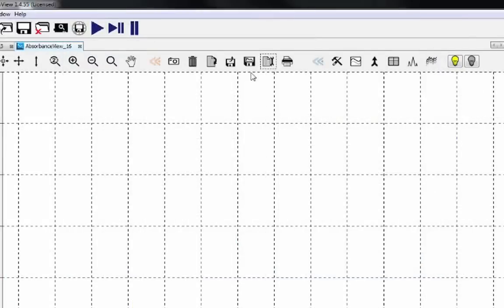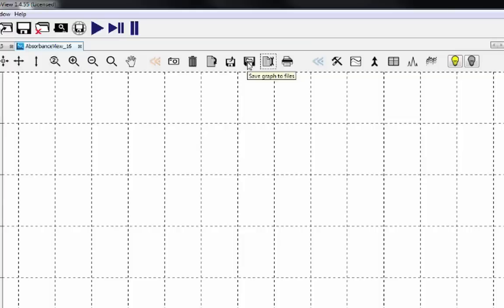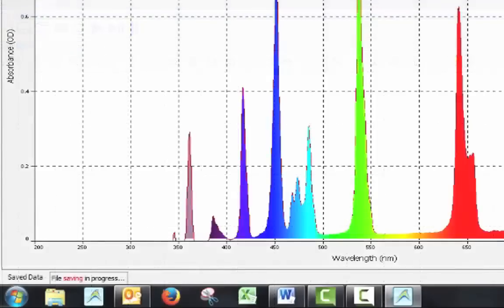Use the save graph to files icon at the top of the screen in order to save the current spectra. You can see that it's saving when the icon turns from black to red, as well as the words file saving and progress appearing at the bottom of the screen.